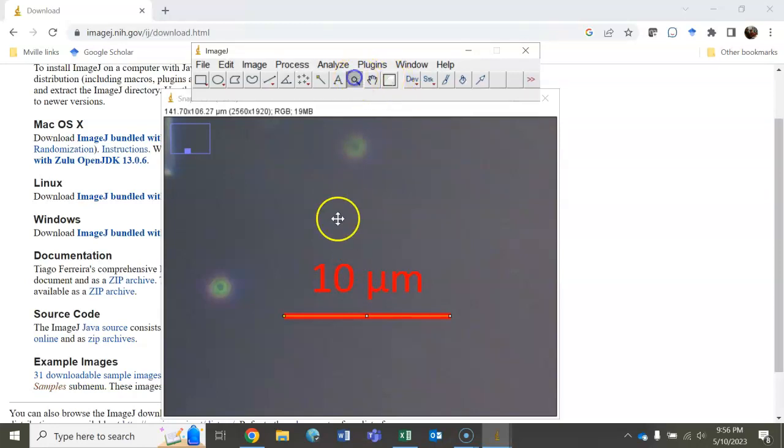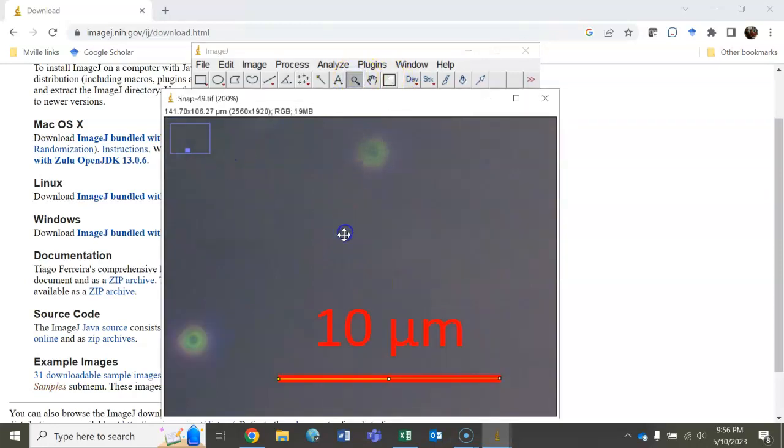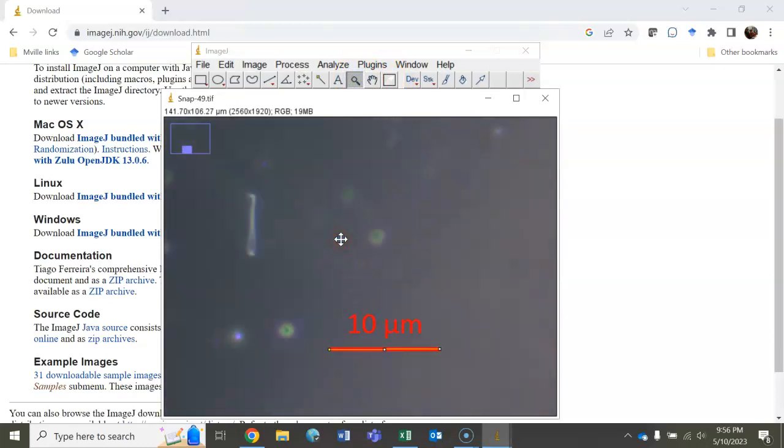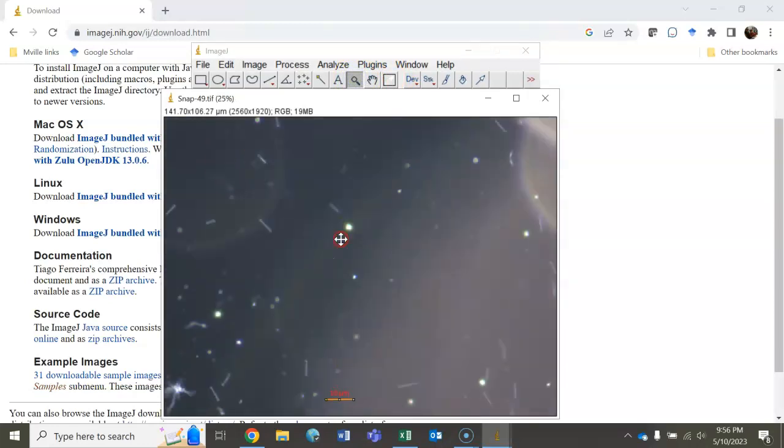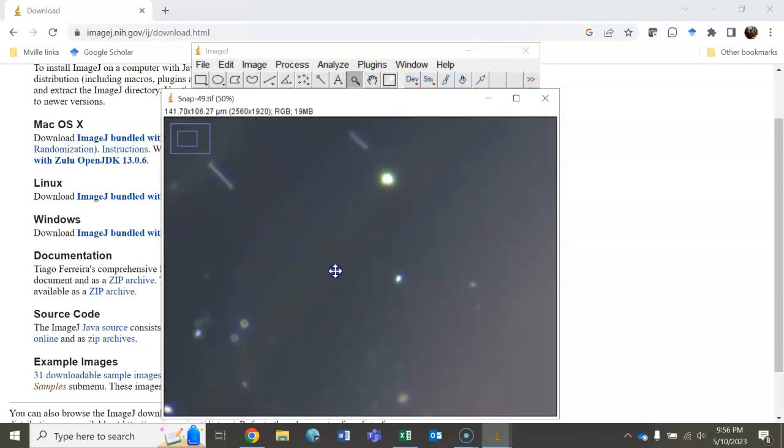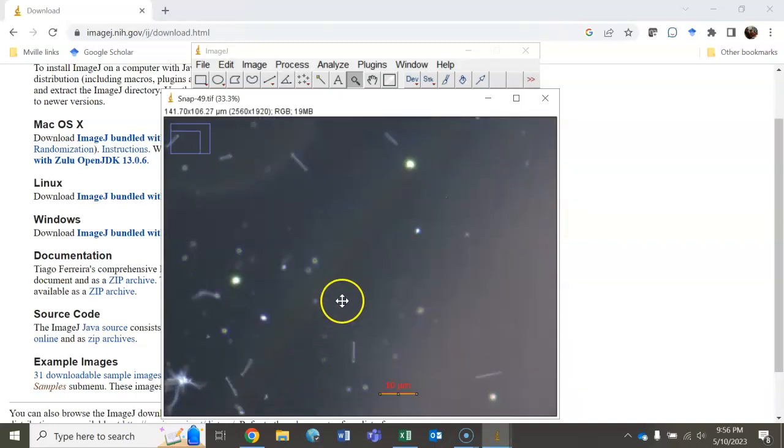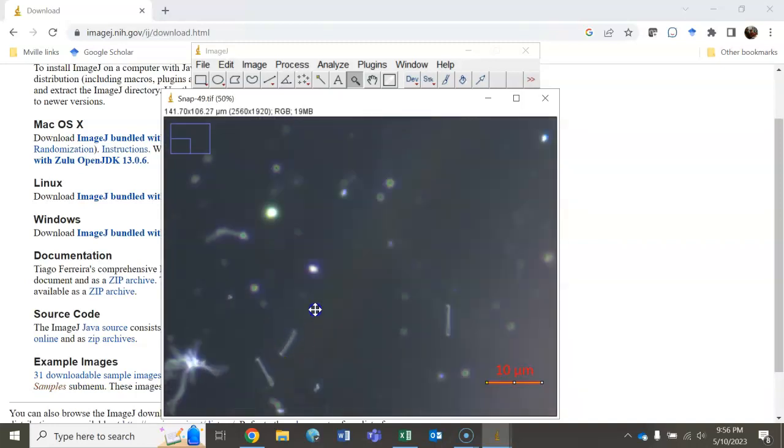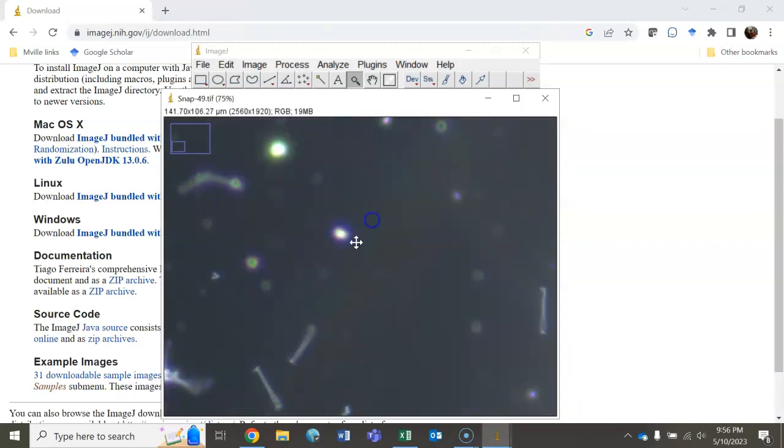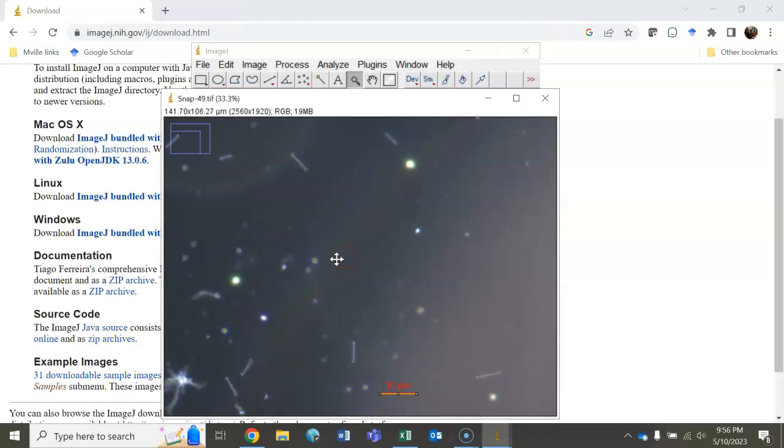Now you can zoom back out at this point. To do that, go back to the zoom function and use the right click button on your mouse to zoom back out. Left click zooms in, right click zooms out.